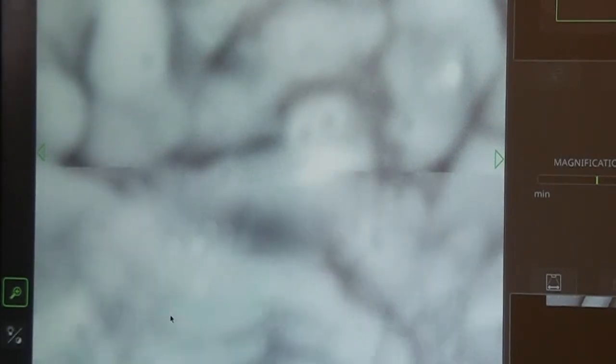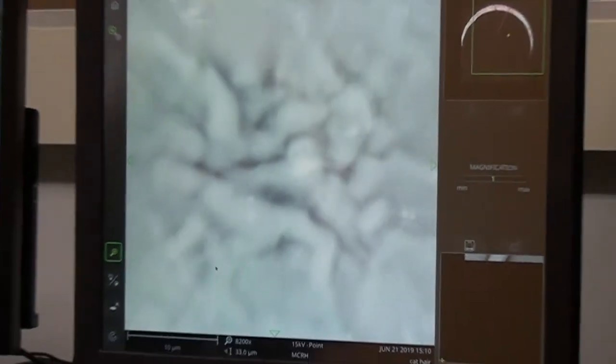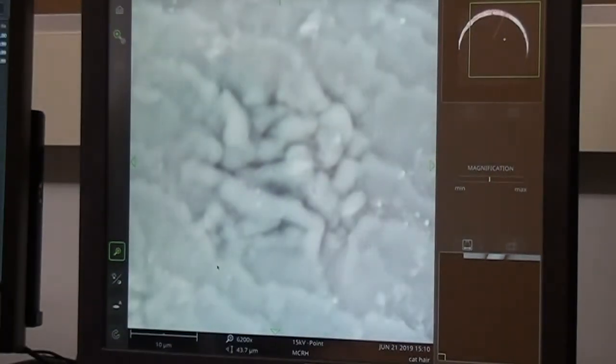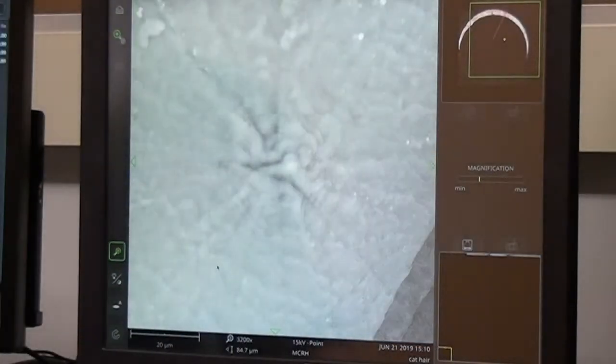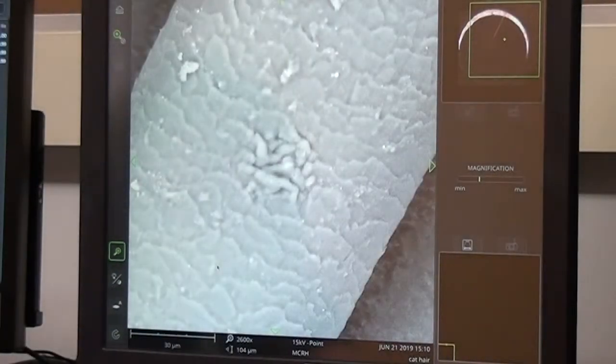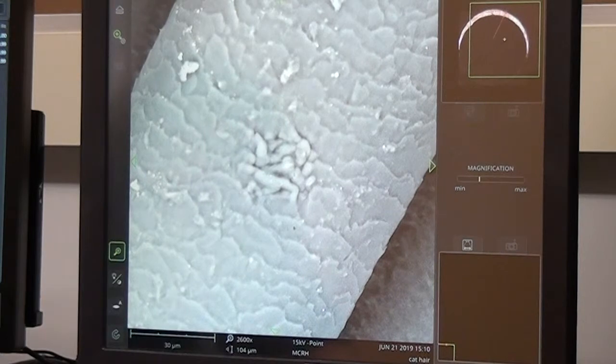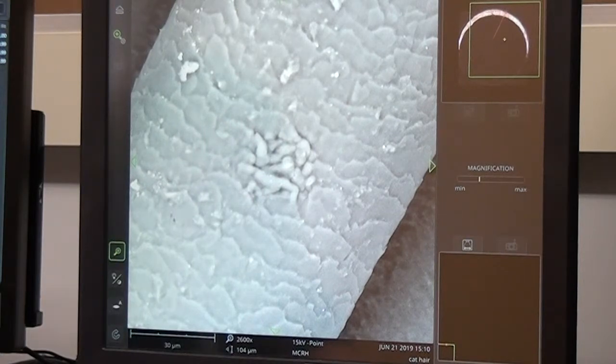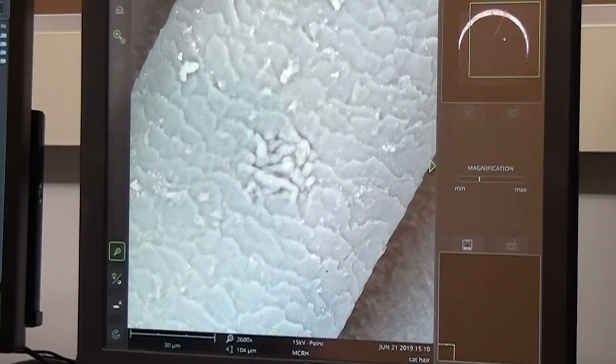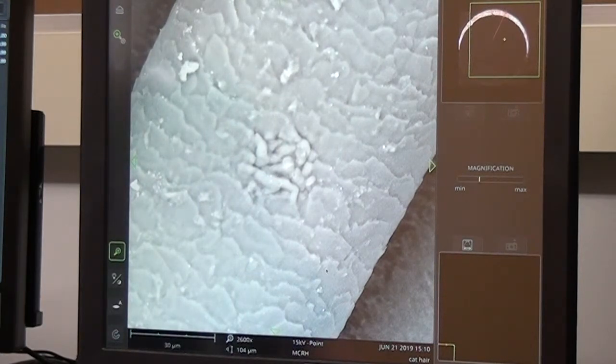So I'm going to zoom out and show you. This has now created a little damaged area in the hair shaft. This is something we don't want to happen. It's bad for the sample and it's bad for the machine.